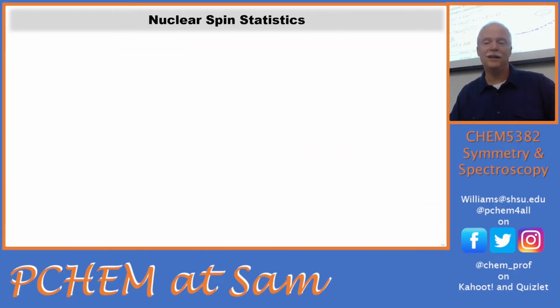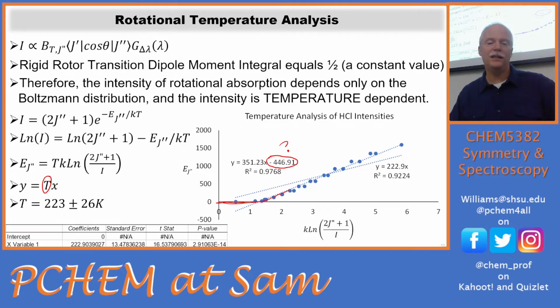But the point is, this is an analysis you can use to get rotational temperatures. That's also part of why it took me so long to do these notes. I had to check these results and make sure I couldn't find the problem, and so I beat my head on this a little bit. It's one of those open questions. I wasn't able to answer it before today. Also, if this model is going to hold well, your data needs to have this zero intercept, and our data has drifted somewhat. I don't know if it's because of baselining the data or what.